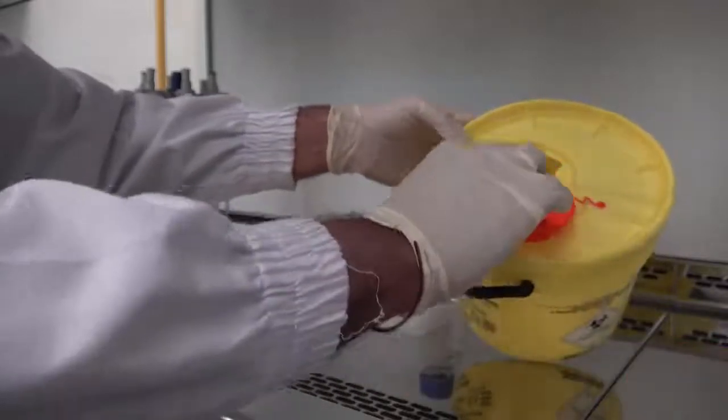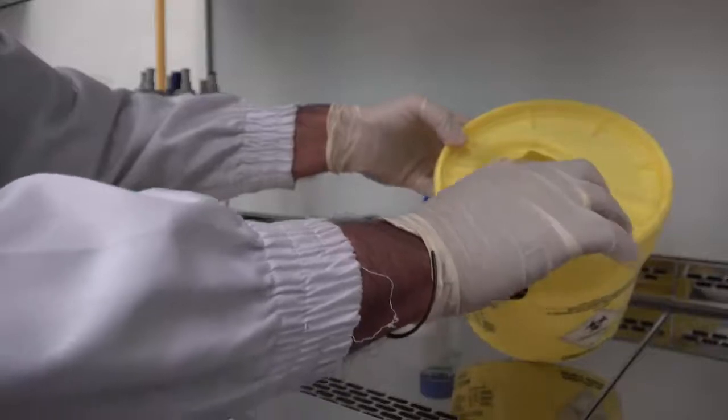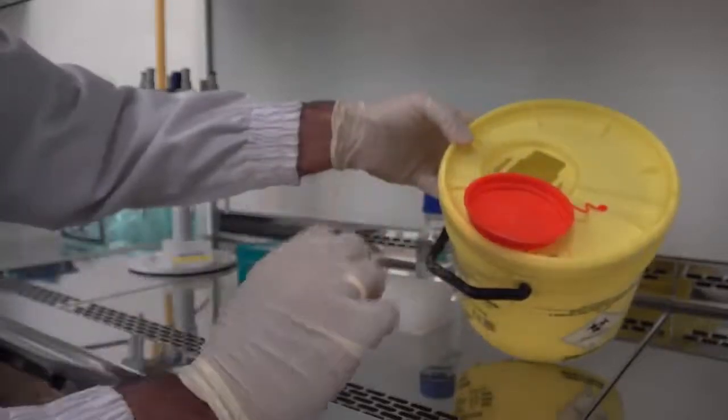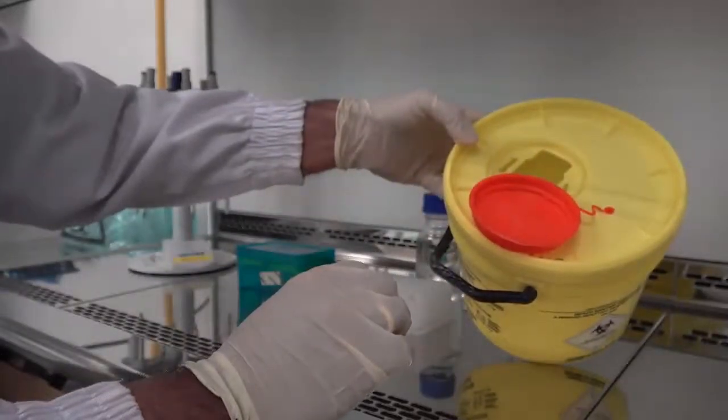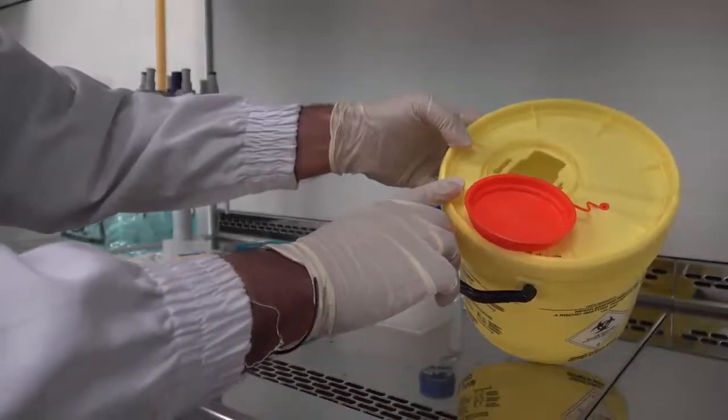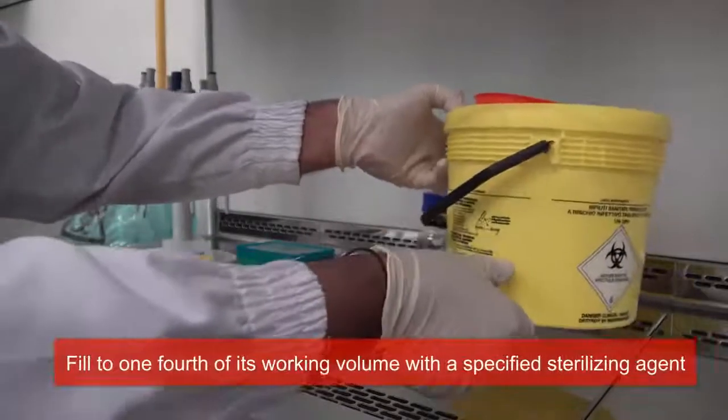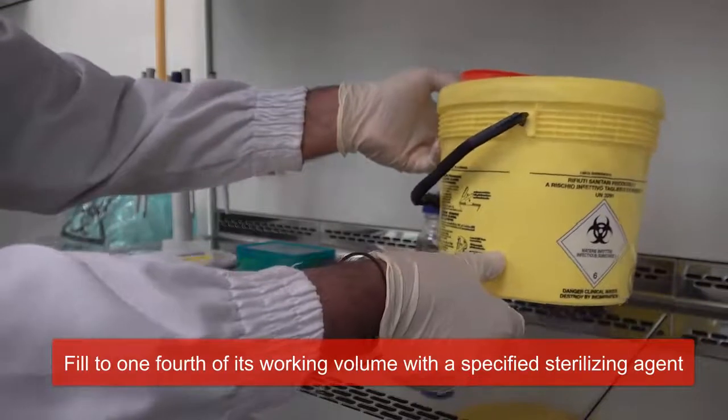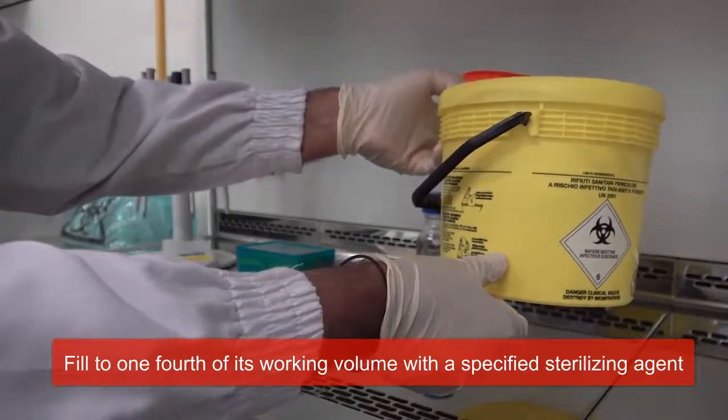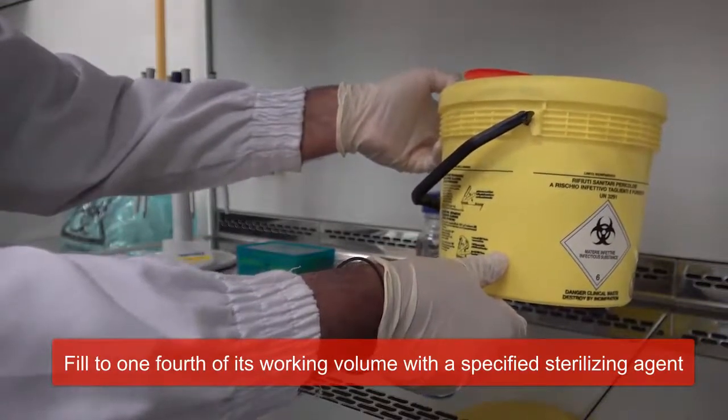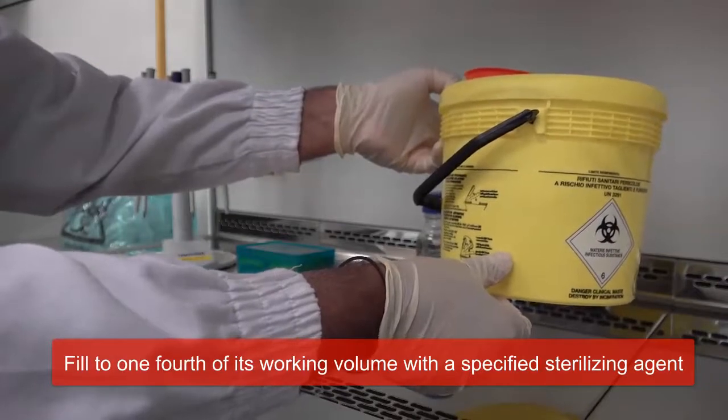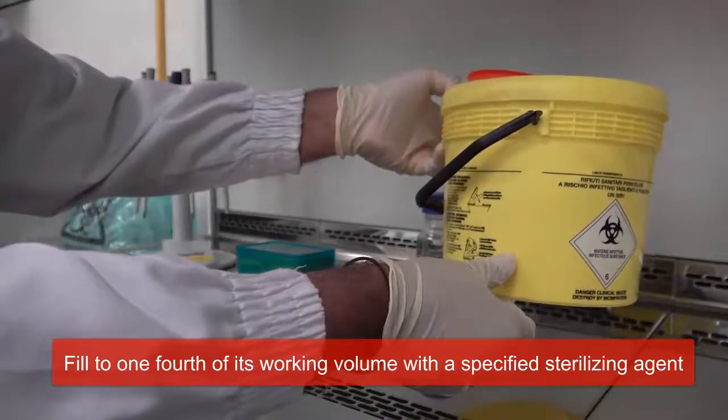This waste container is specially designed for sharps and other disposable waste. For the purpose of our biological safety cabinet, pipette tips are considered as sharps and are disposed in this container. The container is filled to one-fourth of its level with a designated sterilant. In this case I am using 70% ethanol.